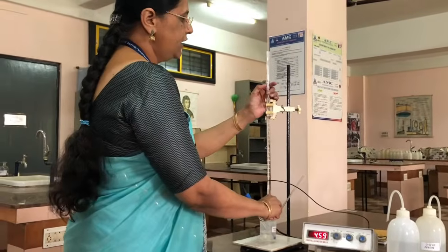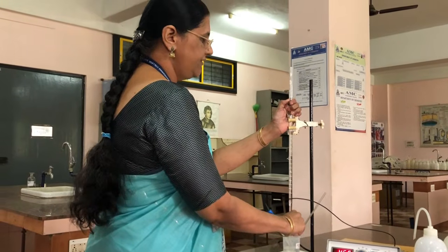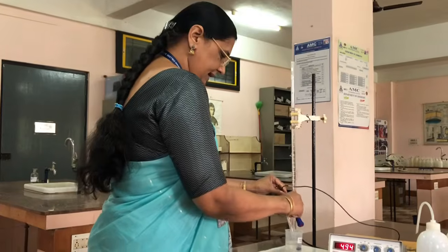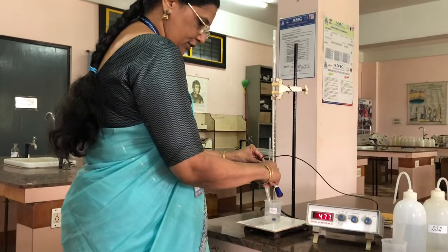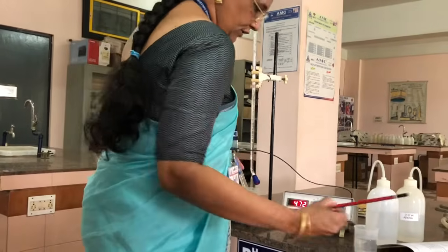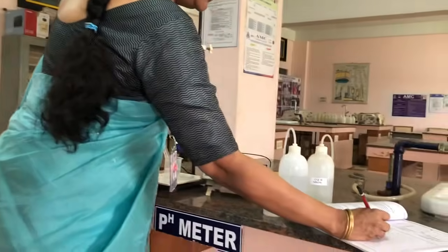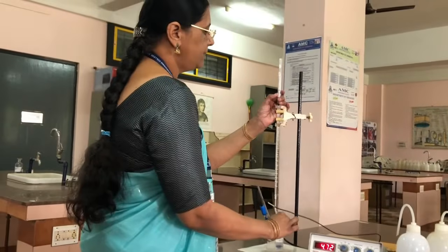So like this, you have to continue the reaction with the addition of 0.5 ml all the time, and after addition of each 0.5 ml, you have to shake the solution and note down the pH of the solution as 4.7. Again, you have to add 0.5 ml.